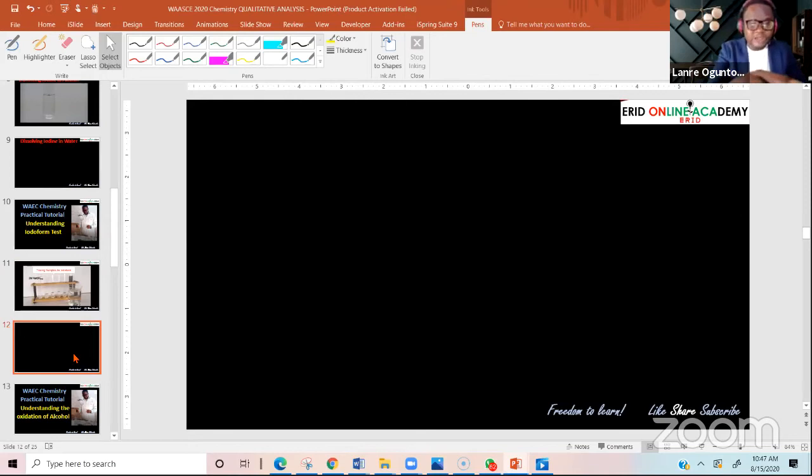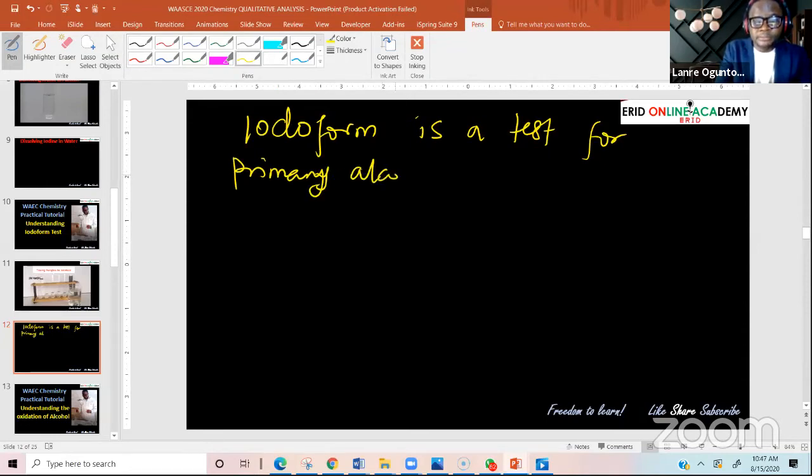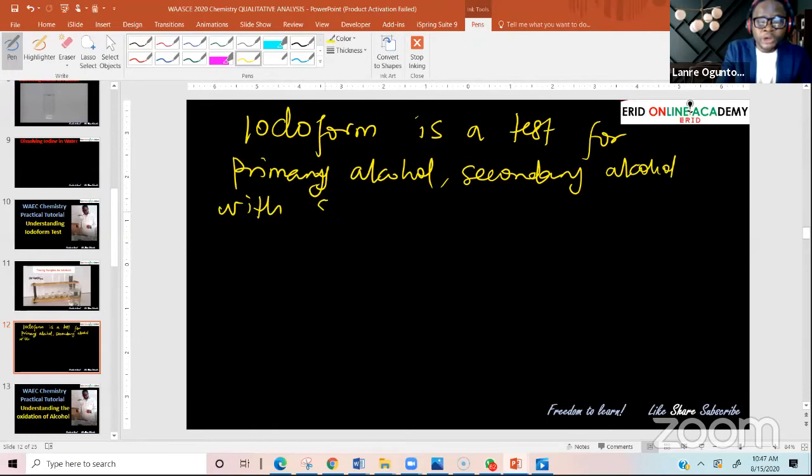So let me explain this quickly. When you talk about the iodoform test, it is a test for primary and secondary alcohol with special features.